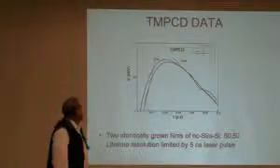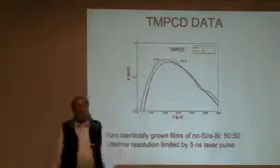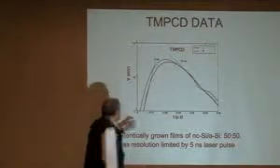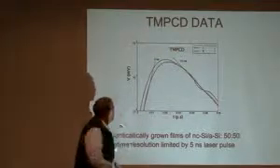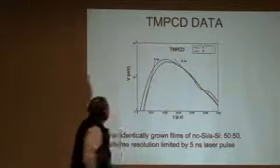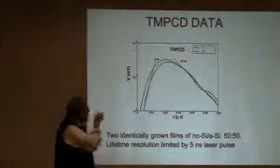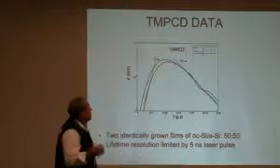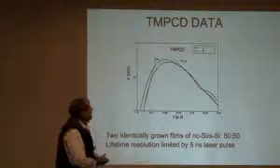Well, what does this mean? This is the response of our laser. Our laser has a full width half max of about 5 nanoseconds, so the photoconductivity is just following the rise of the laser. So the laser pulse, if we superimpose it, would be about 5 nanoseconds wide here. What we see on the other end is a characteristic that comes from the sample itself, the photoconductive decay in the sample. We see a 12 nanosecond decay time.